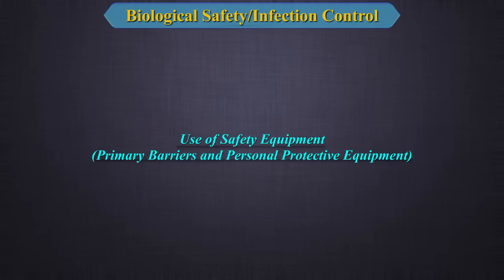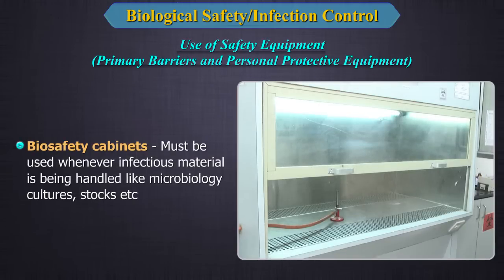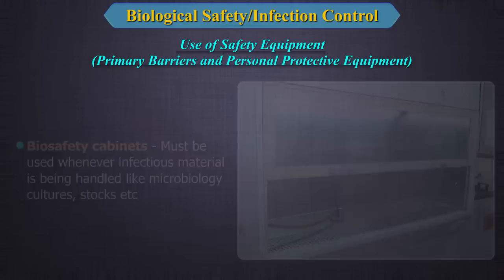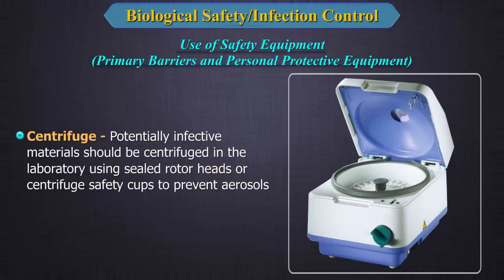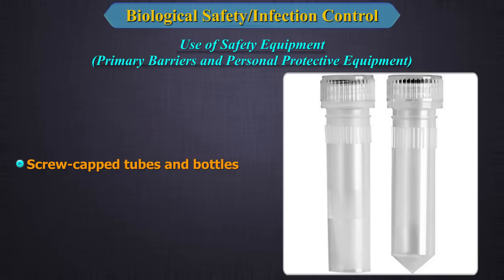Regarding safety equipment providing primary barriers and personal protective equipment: 1. Biosafety cabinets must be used whenever infectious material is being handled, such as microbiology cultures and stocks. 2. Centrifuges — potentially infective materials should be centrifuged using sealed rotor heads or centrifuge safety cups to prevent aerosols. 3. Screw-capped tubes and bottles.